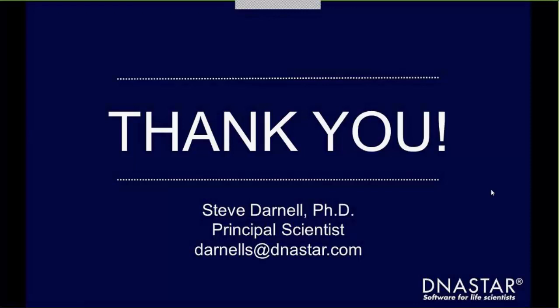Thanks, Steve. And our last question for today is with regards to your mentioning that NovaFold antibody predictions often just take a few minutes, whereas NovaFold predictions can take a few hours. And our attendee wants to know why that happens. Someone was looking at the predictions view closely, so thank you for catching that.